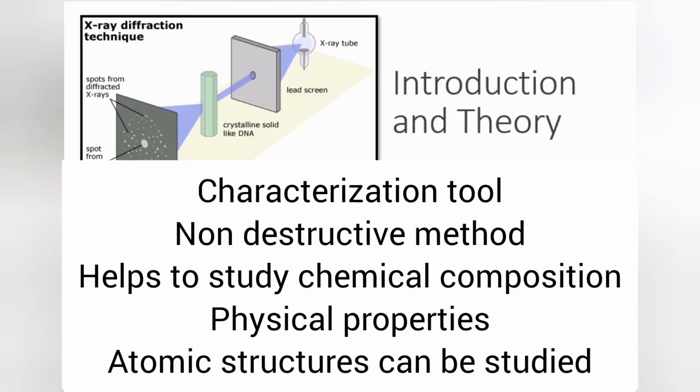X-ray diffraction techniques are very useful characterization tools to study, non-destructively, the crystallographic structures, chemical composition and physical properties of materials and thin films. A diffraction pattern provides the atomic structures of molecules such as powders, small molecules, or larger ordered molecules like protein crystals also. Let us see more details about it.